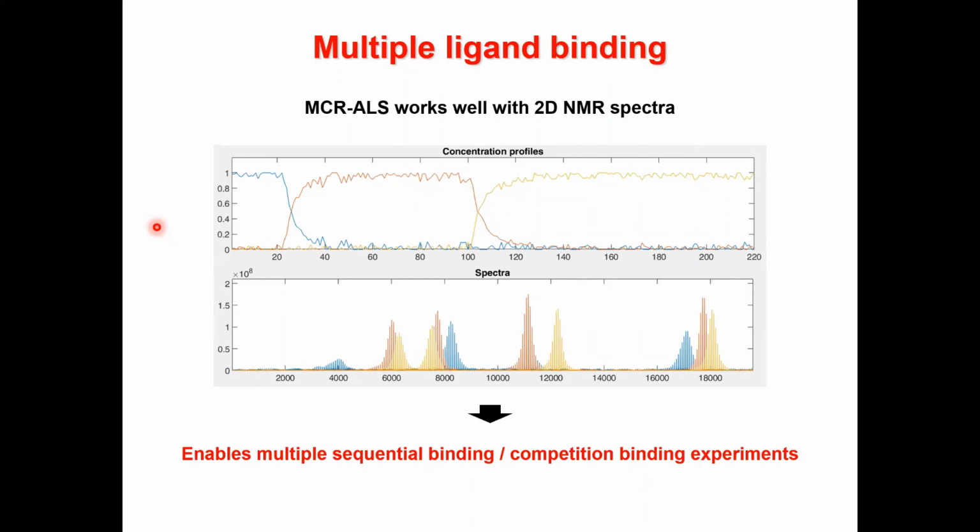So I think this gives you an idea of what can be done with the bioreactor. Although I'm focused on protein-ligand interaction, you realize that these methods, in principle, can be applied to any intracellular event. Anytime you see a signal that responds to your stimulus in a way that you can measure, in principle you can apply the bioreactor to study intracellular kinetics.